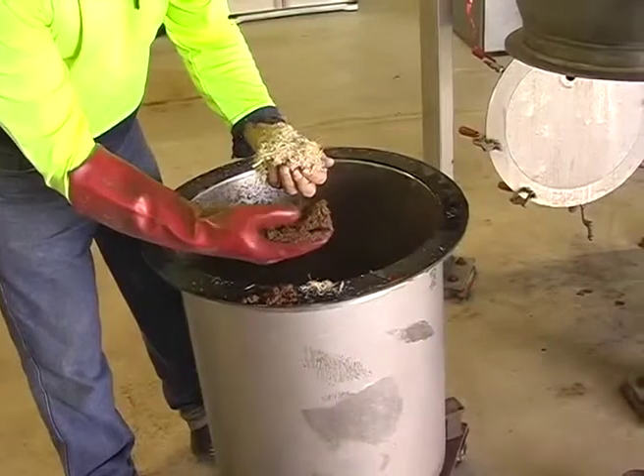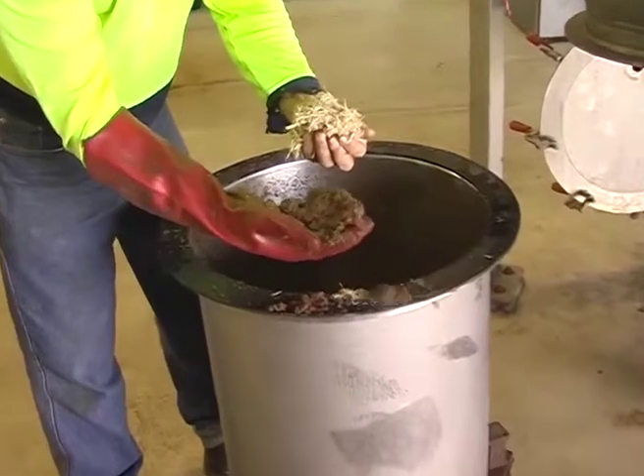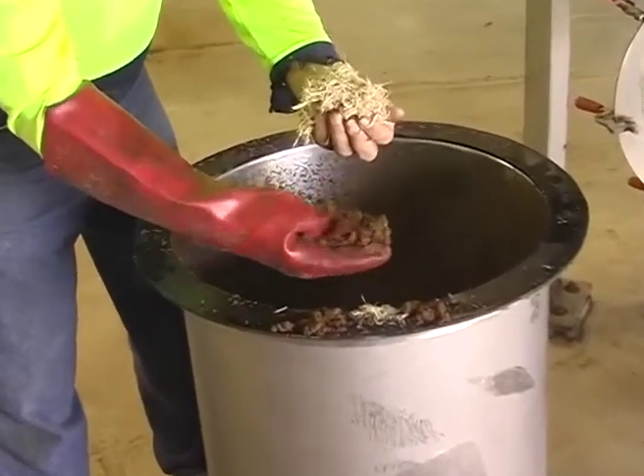This is the sugarcane bagasse before we do pre-treatment. And this is the sugarcane bagasse after the pre-treatment steam explosion.